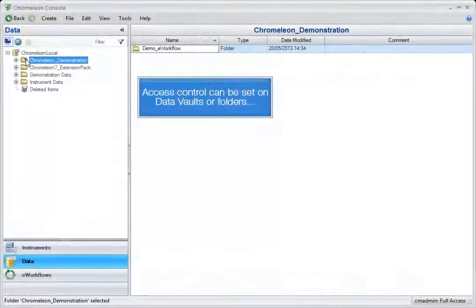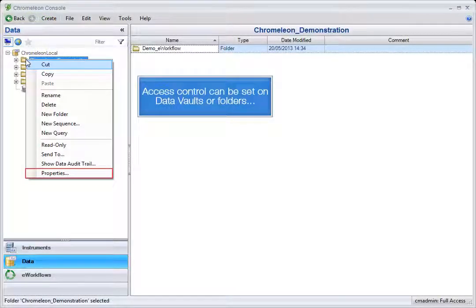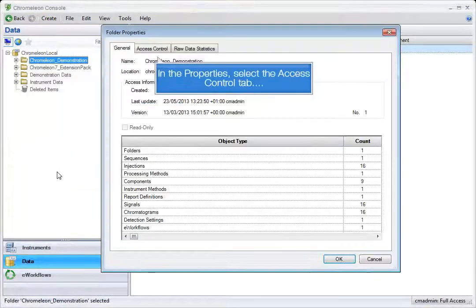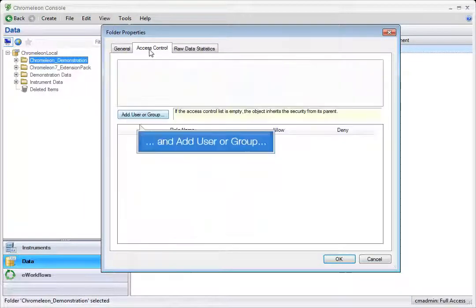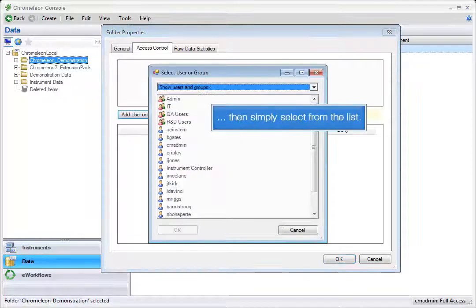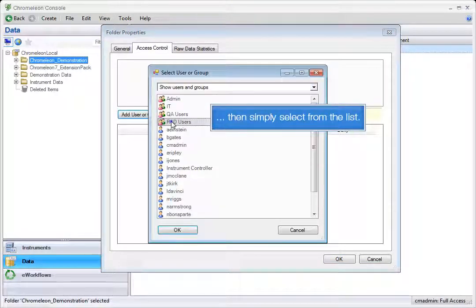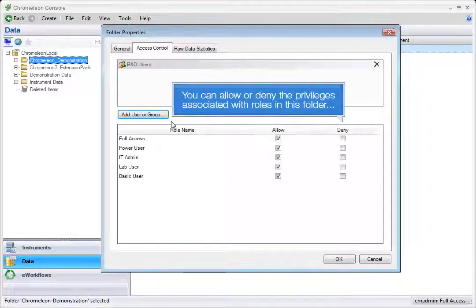Access control can be set on data vaults or folders. In the properties, select the access control tab and add user or group. Then simply select from the list. You can allow or deny the privileges associated with roles in this folder.